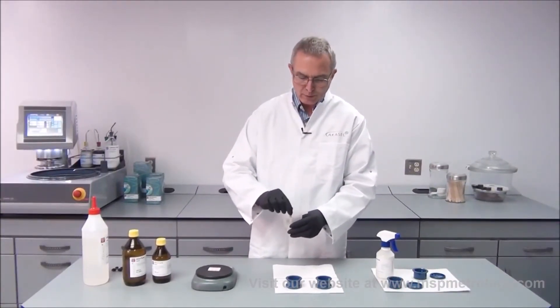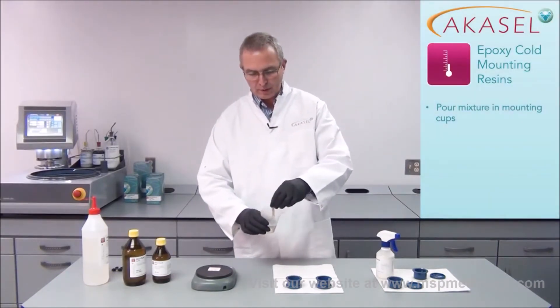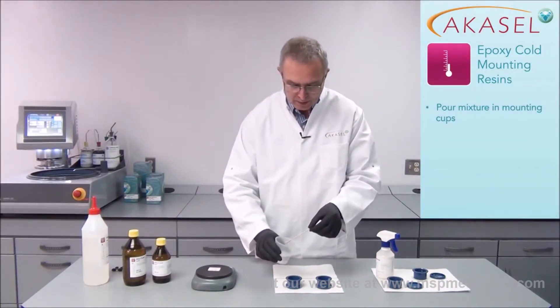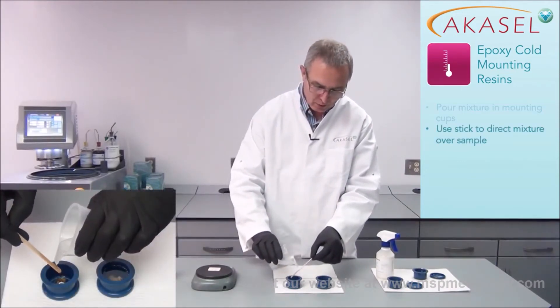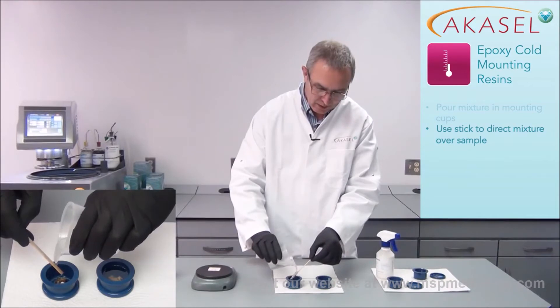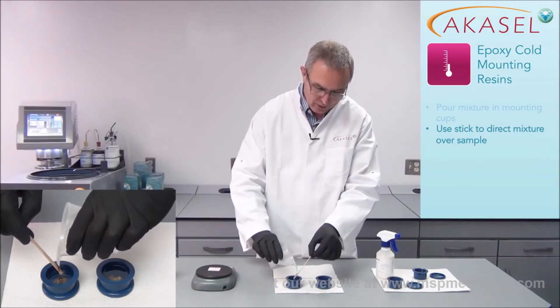Now I've been mixing thoroughly for 3 minutes and I'm ready to pour the mixture into the mounting cups. I use my mixing stick to direct the mixed resin onto the sample, which makes it easier to cover the sample correctly and also avoids trapping air bubbles around the sample.